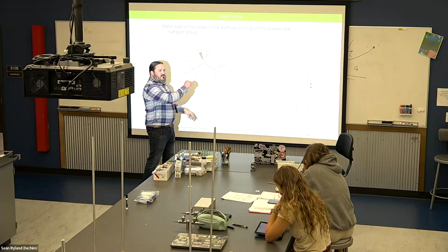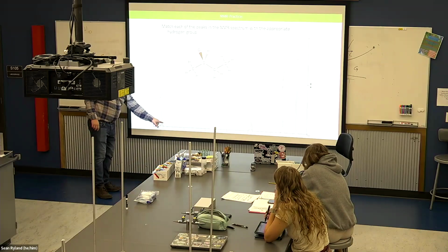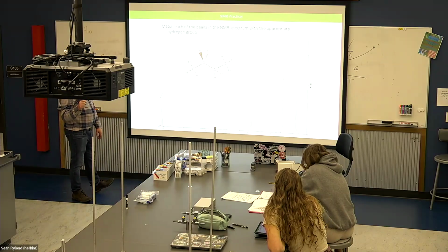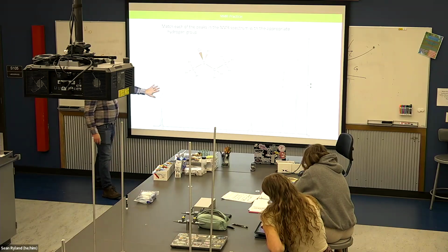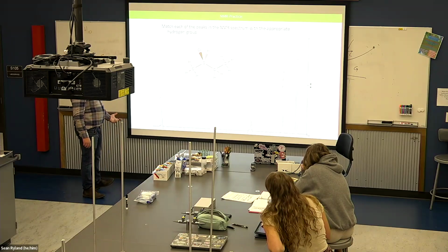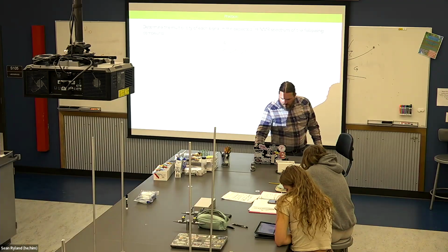So the peak furthest to the left should be a sextet. 1, 2, 3, 4, 5, 6. And the integral of that should tell us something too, right? Because there's only one hydrogen that's part of that signal. So we should have the smallest integral, the furthest downfield, and the most nearest neighbors. So if it has 5 nearest neighbors, yeah.